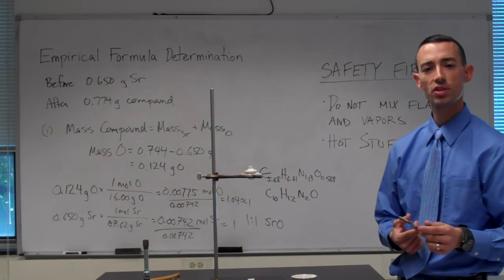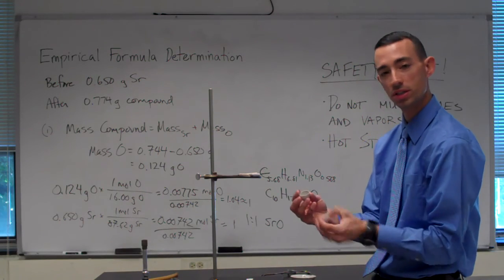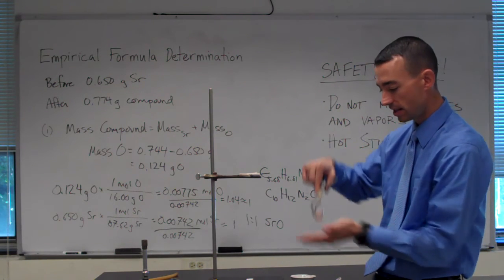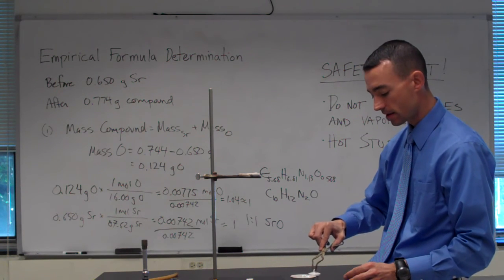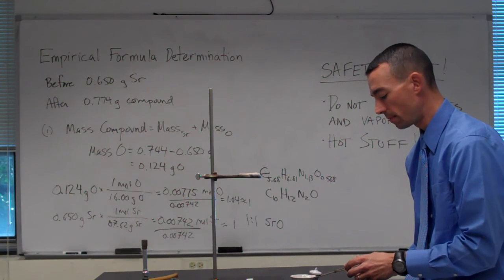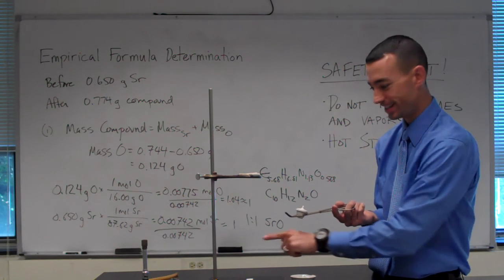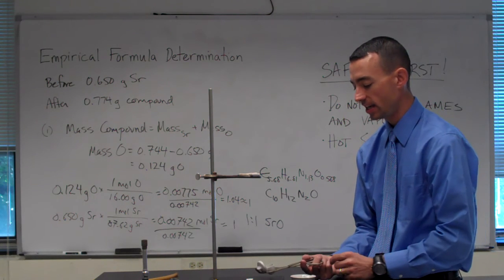The second reaction between the copper and the sulfur will take place in a crucible. Again, a little tiny porcelain dish here. And when the crucible's not hot, it's very easy to grab by, again, the tips of the crucible tongs, and the lid can be handled in the same way. Now, when it's hot, you might find yourself needing to scoop it up in the dents of those tongs. So it takes some practice. Don't squeeze it too hard like I did just a second ago and send it flying across the lab.